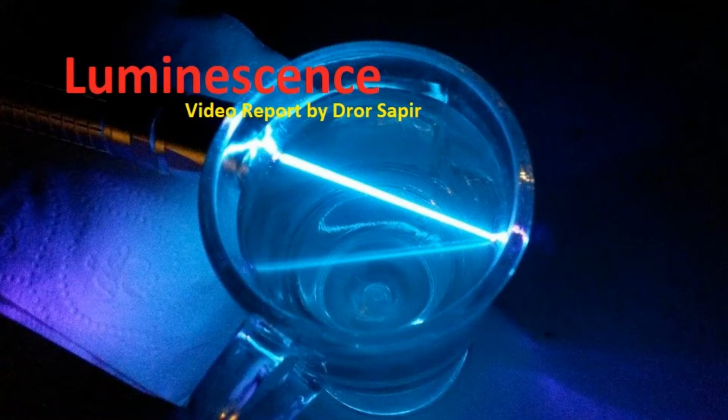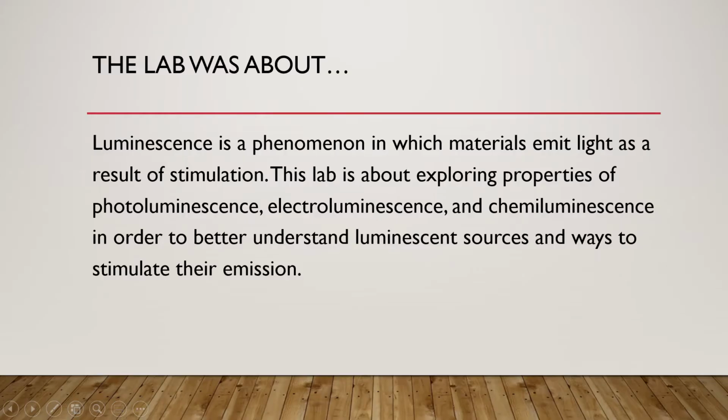I'm Dror Sapir. This is luminescence. Luminescence is a phenomenon in which materials emit light as a result of stimulation.